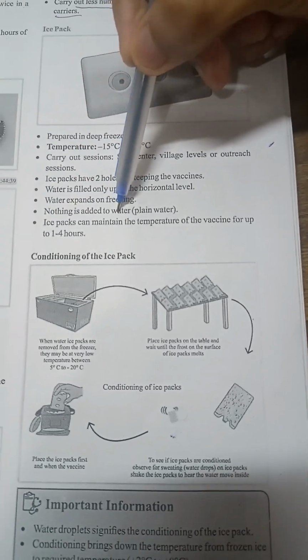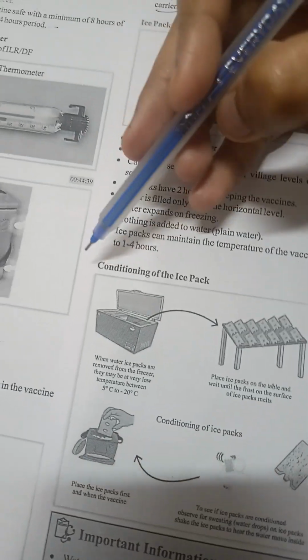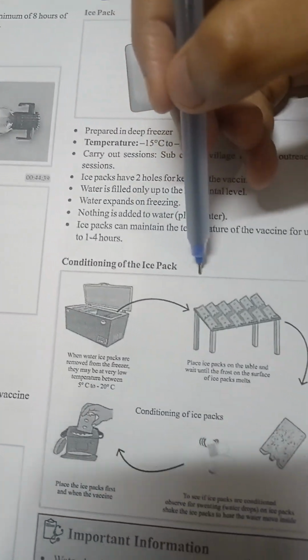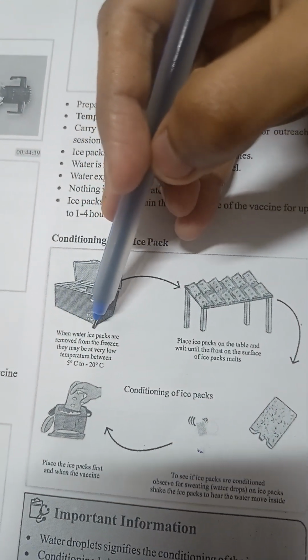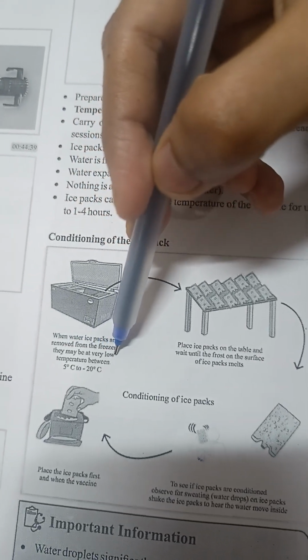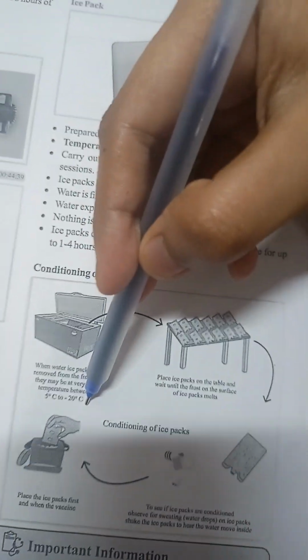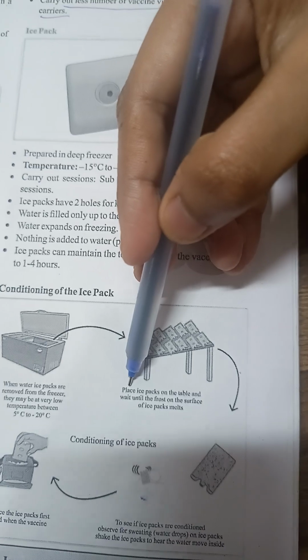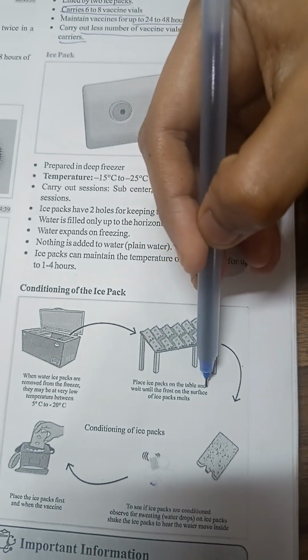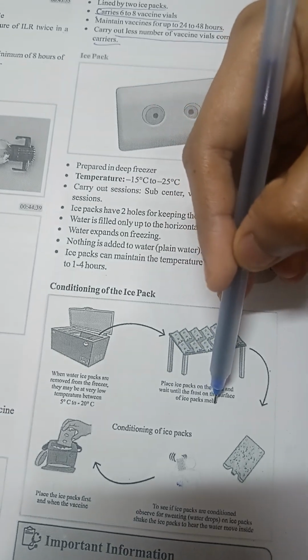Ice packs can maintain the temperature of a vaccine for up to 1 to 4 hours. Conditioning of ice packs: when water ice packs are removed from the freezers, they may be at very low temperature, between minus 5 degrees Celsius to minus 20 degrees Celsius. Place the ice pack on the table and wait until the frost on the surface of the ice pack melts.